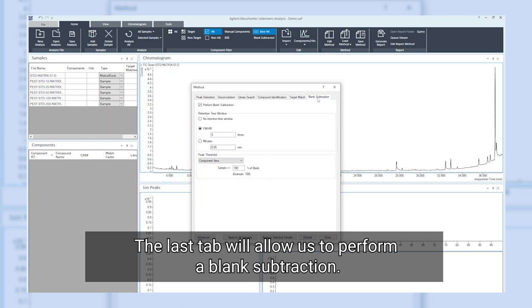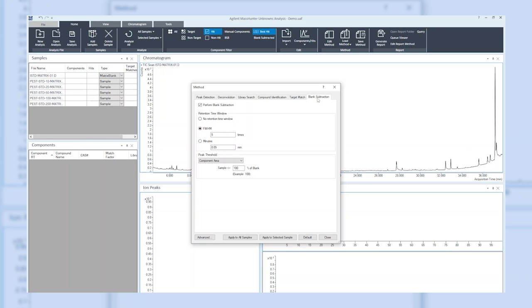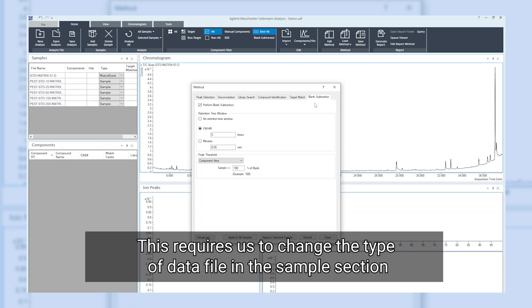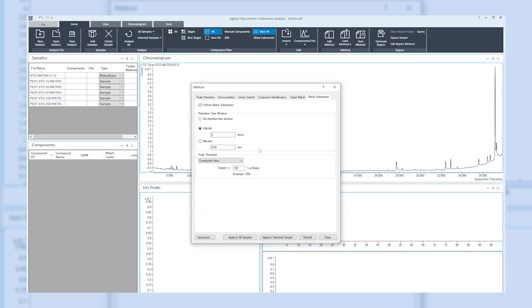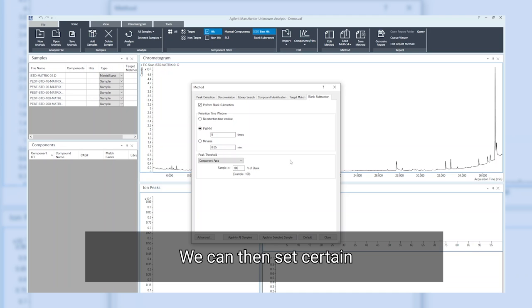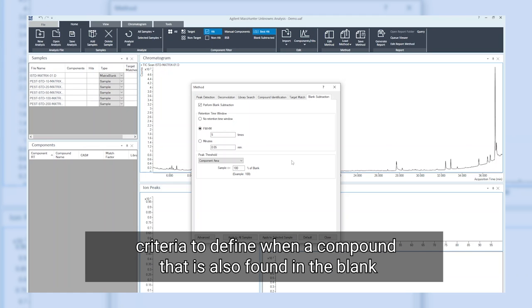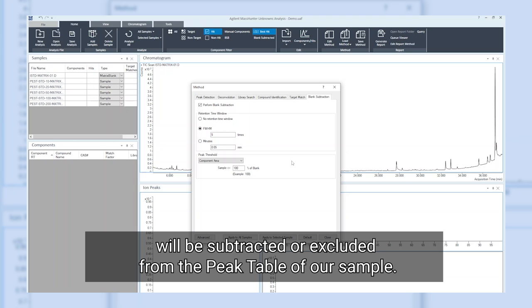The last tab will allow us to perform a blank subtraction. This requires us to change the type of data file in the sample section to blank or matrix blank. We can then set certain criteria to define when a compound that is also found in a blank will be subtracted or excluded from the peak table of our sample.